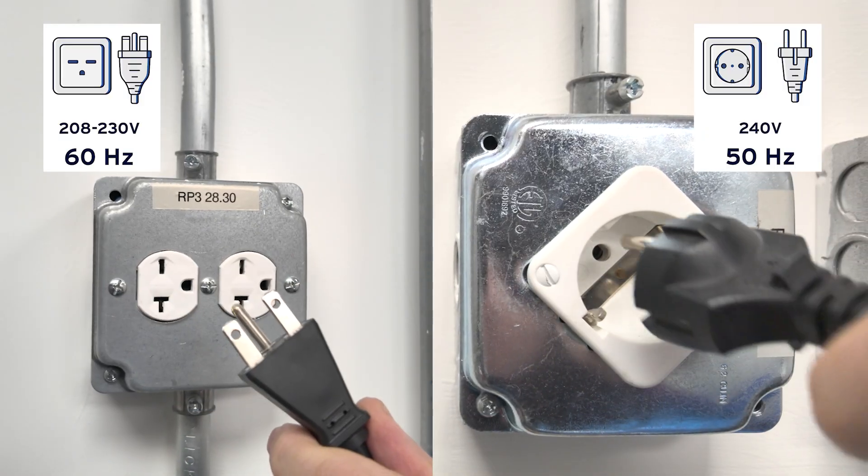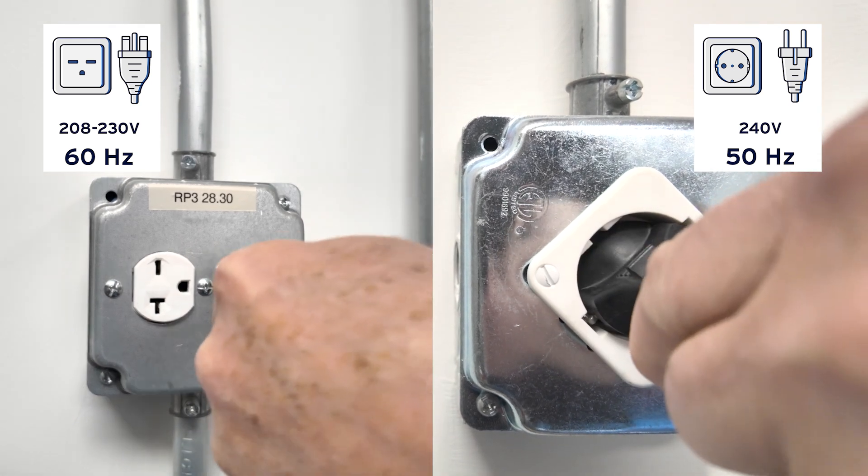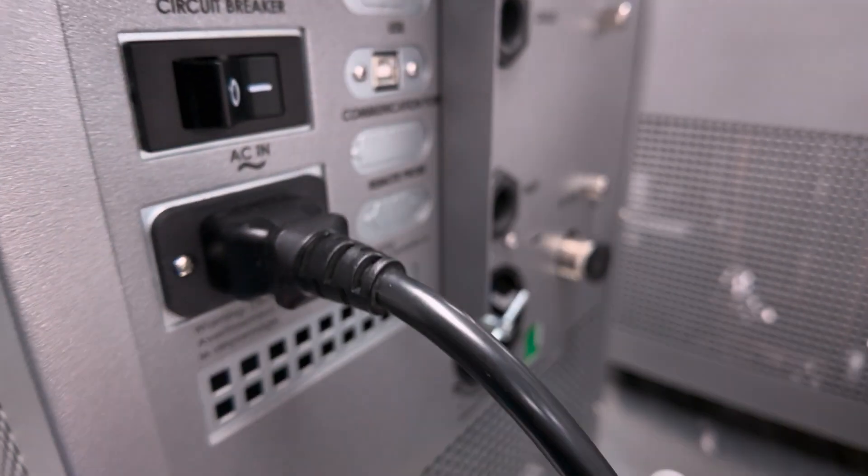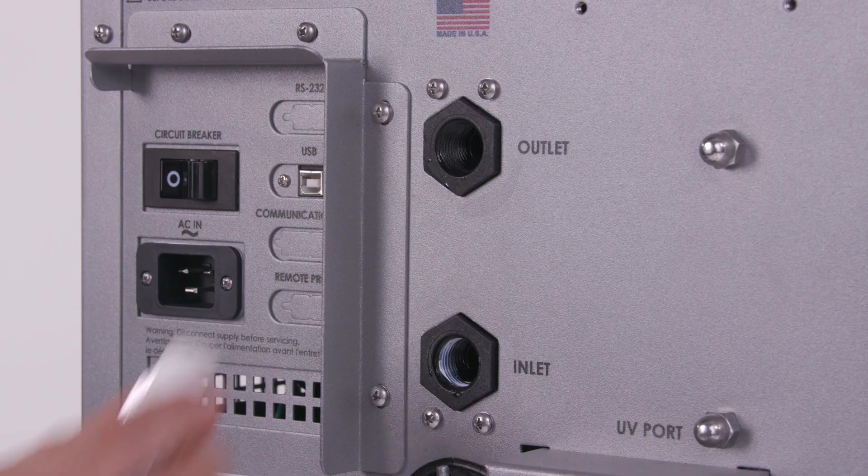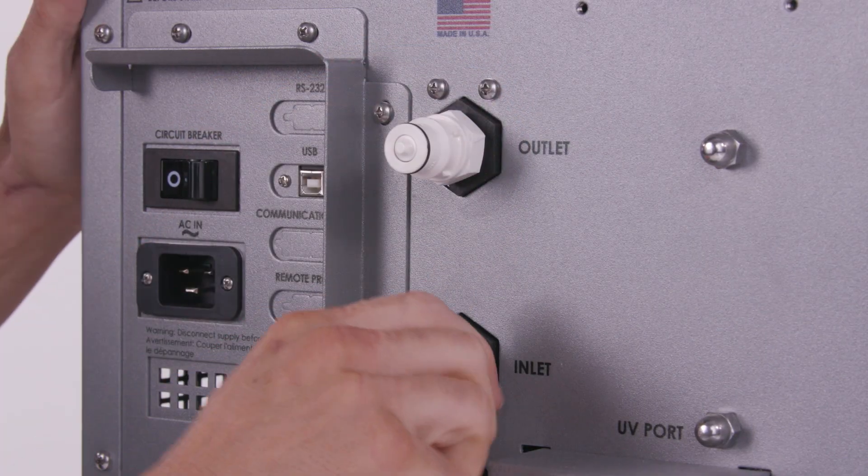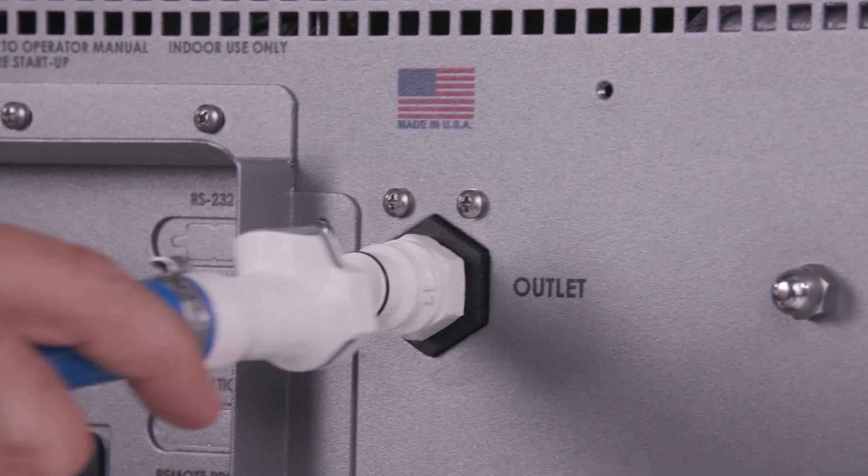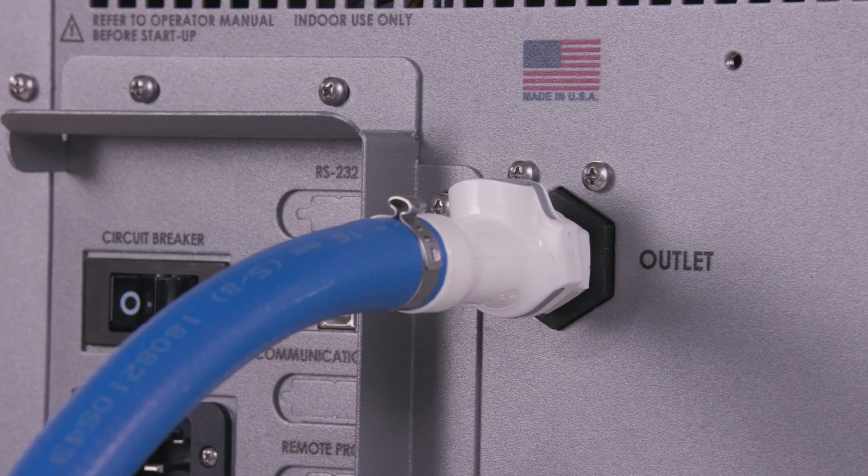Ensure that the power cord is fully inserted at both the outlet and the chiller power inlet. Connect the fittings at the rear being careful not to over tighten. Connect the tubing to the unit being cooled.